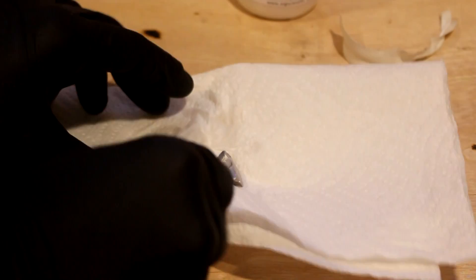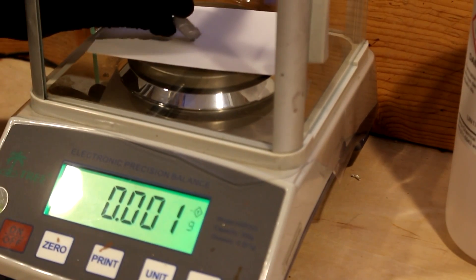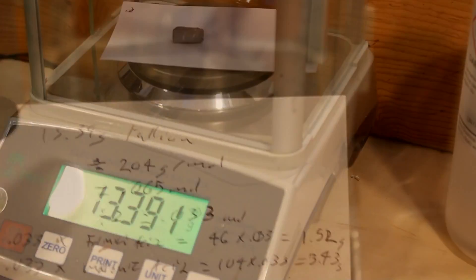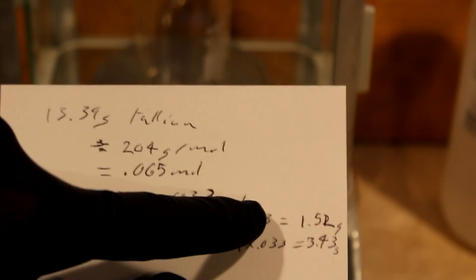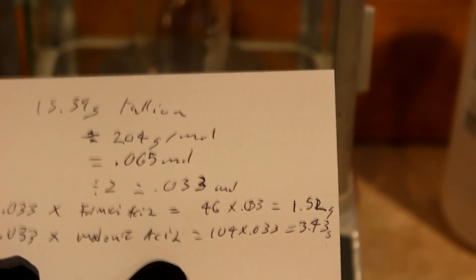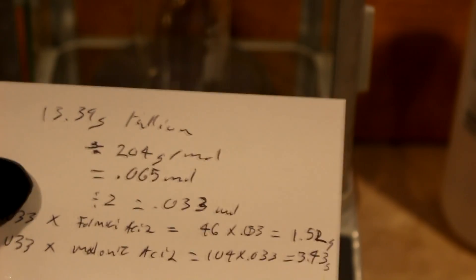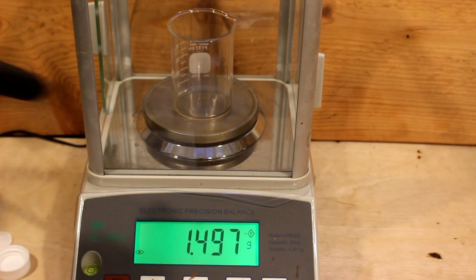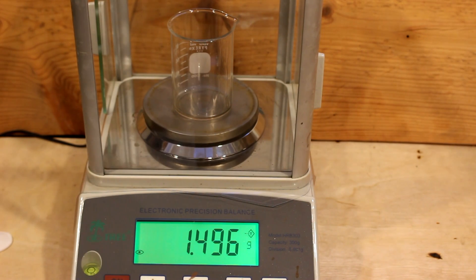Get all that mineral oil off of it so I know exactly how much I have. I've worked out that I need one and a half grams of formic acid and 3.4 grams of malonic acid. So let's weigh them out. I'm going to call that good. So there's our acids.